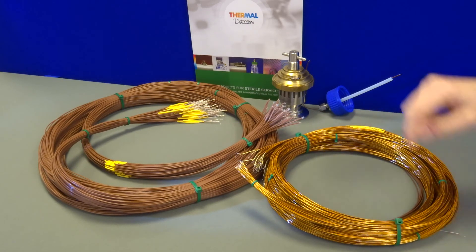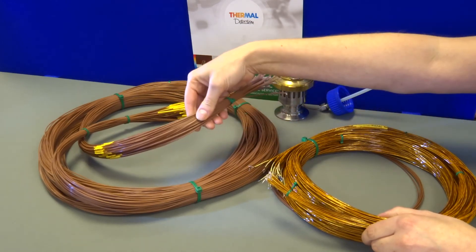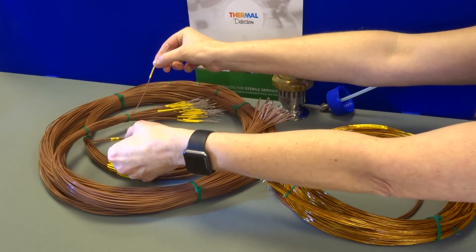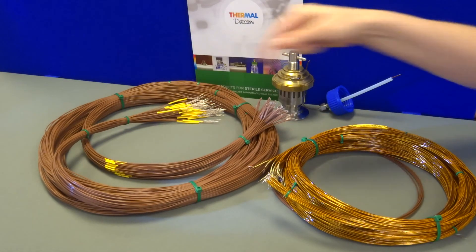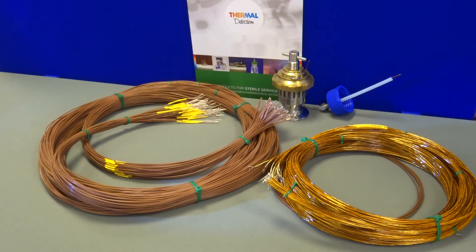Validation thermocouples are available in looms, which are also known as bundles. They are tagged and numbered, identified at both ends of the thermocouple. A loom is cable tied throughout the length, which allows the engineer to effortlessly place each hot junction at designated points, snipping the cable ties as he goes.